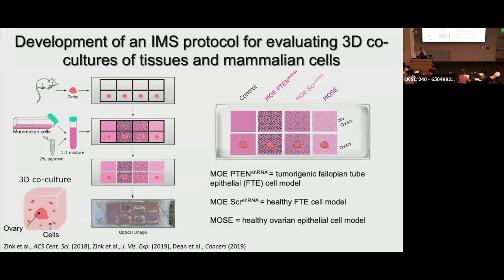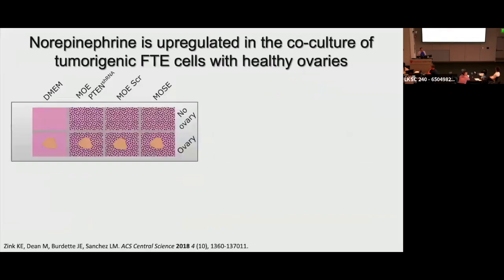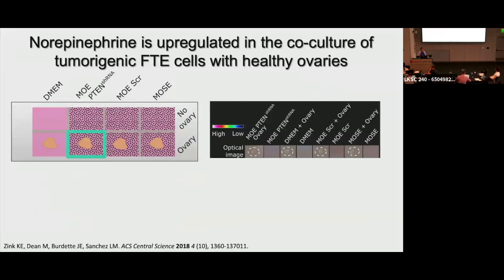So this is the kind of experiments that we like to do. And if you're like, what does all this look like? That's what it looks like in the dried optical image. So these things dry nice and flat, and the whole thing can just go into the mass spectrometer. And so a summary of one of the early things that we found. So this is just, you're going to be looking now at all these different experiments, and you're going to be visualizing these ion images of the mass to charge ratios as a high to low.